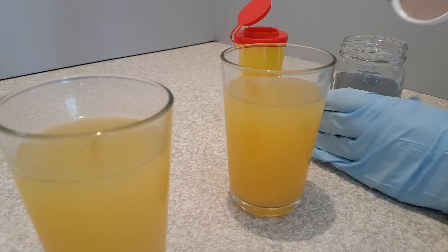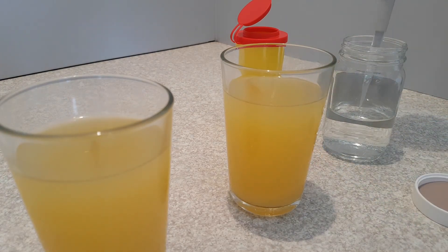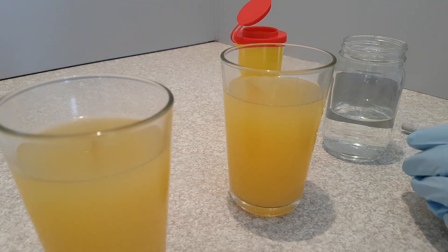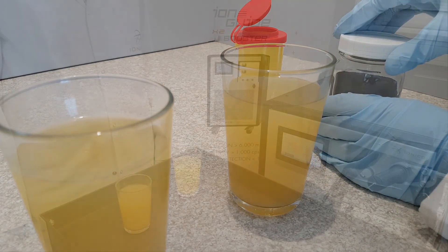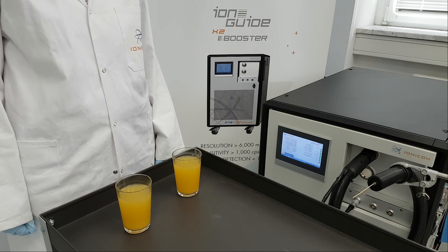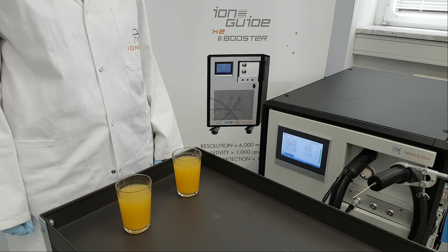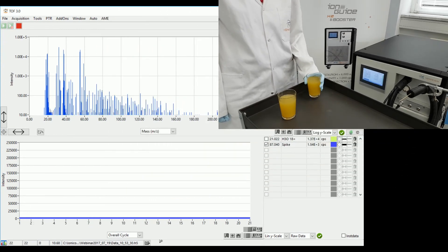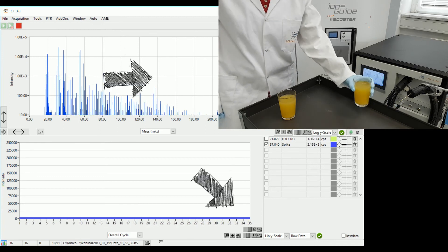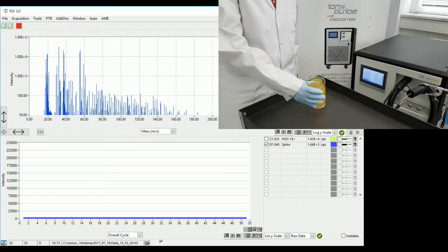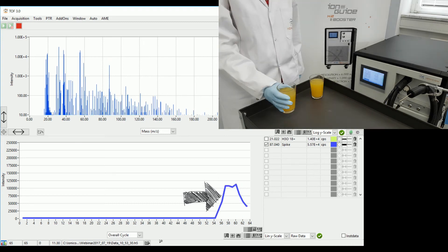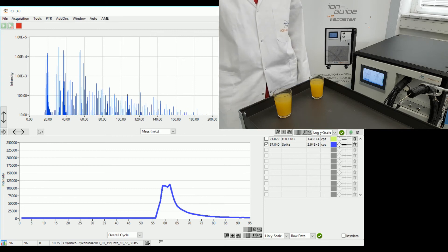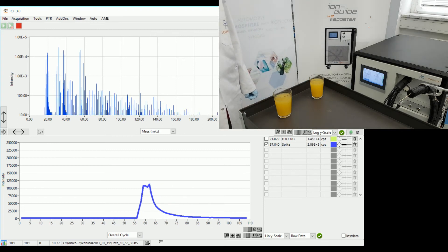I have prepared two glasses of commercially available orange juice. I will spike one of these glasses with a few microliters of a chemical compound — an amount below the human's detection level. As a next step, I analyze the headspace of the two glasses of orange juice one after the other. First, I measure the non-spiked orange juice: looking at the mass spectrum, you can see aroma compounds rising, but not the signal of the added compound. Then I analyze the headspace of the spiked juice, and you can see the signal of the added compound rising within milliseconds. Although the orange juice is a complex matrix, PTRMS is selective and sensitive enough to detect the compound of interest in real time.